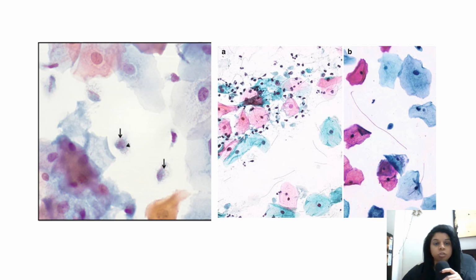So as we all know, you can see organisms that are pear shaped in the pap smear, and this is a very classical exam slide also, because examiners love showing Trichomonas vaginalis. Okay, that is the answer. So foul smelling greenish yellowish discharge and strawberry cervix are the classical symptoms.